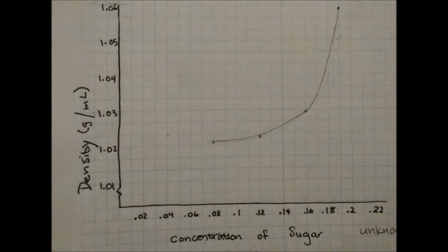The final step of this lab is creating a graph comparing the concentration of sugar to the density of the solution. The graph with the results collected from this video is shown on the screen. You are now ready to complete the lab on your own.